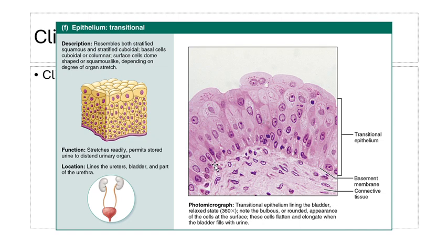At the bottom of this epithelium, we can see some basal cells. Always, basal cells have a role in the repair of our epithelium. It could be in our stratified squamous or stratified cuboidal or transitional.